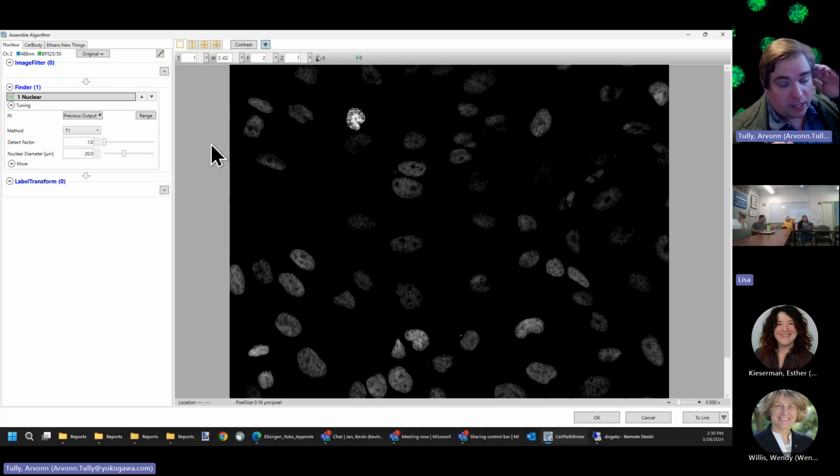That's really cool, because let's say you have a low number of spheroids, or maybe you've got tissue and you want to just scan the tissue on a slide. You can use CVACE to identify that tissue and do the high resolution scan of just the tissue without having to image the entire plate. And you can do that automatically. Cool. So that is not available with the CQ1 analysis software. That multi-pass acquisition requires CellPathfinder. So that's a difference. I'd say it's a pretty major difference.